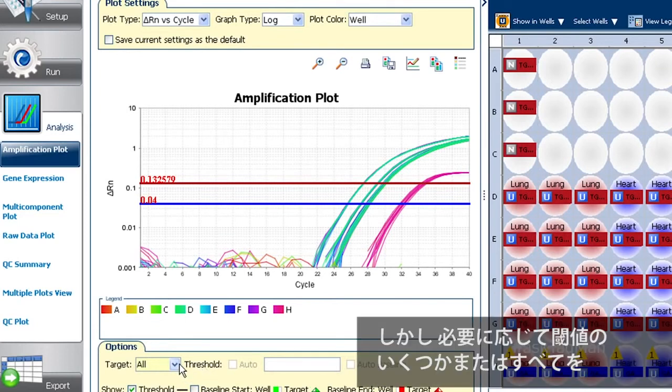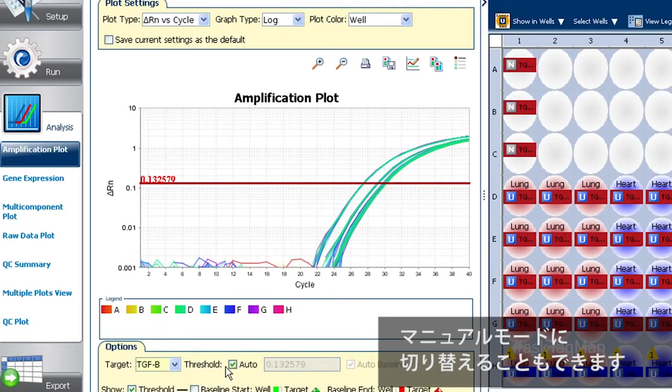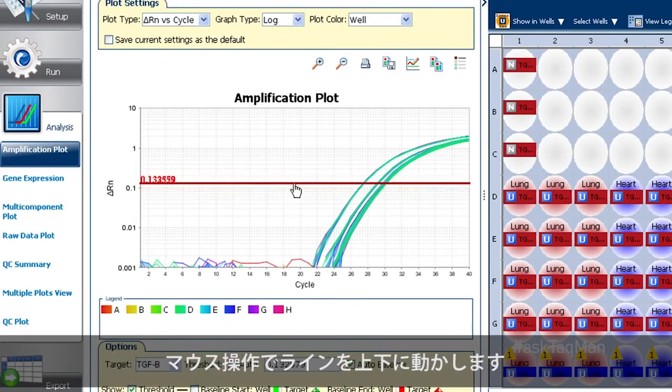If I want though, I can switch any one or all of my thresholds to manual mode, then move the line up or down with my mouse.